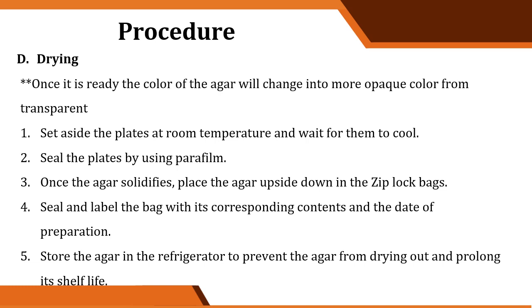Once the agar solidifies, place the agar upside down in Ziploc bags. Okay, seal and label the bag with its corresponding contents and the date of preparation. Store the agar in the refrigerator to prevent the agar from drying out and prolong its shelf life. Instead of parafilm, if you don't have any, I think we could use kahit tape or micropore. Pang-seal lang naman.